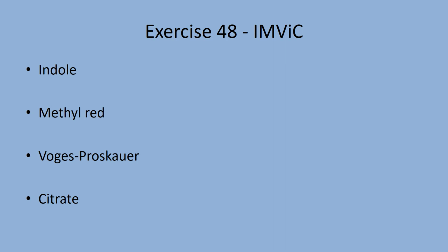Exercise 48 is the IMVIC test. It stands for indole, methyl red, Voges-Proskauer, and citrate.